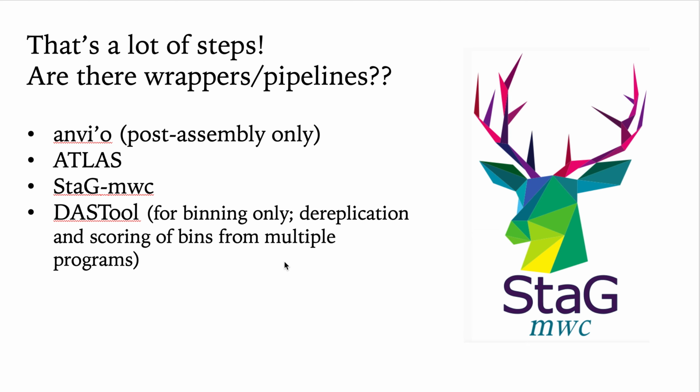So that's a lot of steps. And wouldn't it be nice if we could just feed in our raw reads and get all the outputs that I mentioned in this workflow spit out with minimal effort? Unfortunately, or maybe fortunately, depending on your perspective, that's not really common right now. There are certainly wrappers that exist. I have limited experience with them, and I would recommend doing all of these steps manually if you're just getting started, so you have an understanding of the process. But there are a couple options if you want to automate parts of this workflow down the line.